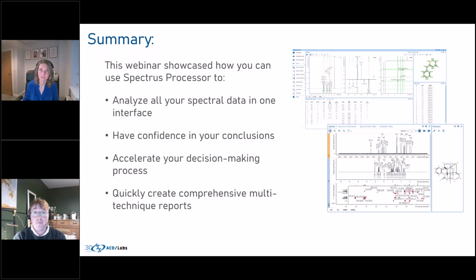Okay, brilliant. We've got someone here saying they're more interested in academic analysis of polymers, more specifically NMR and FTIR data. Do we have any more detailed analysis, or can we do any more for polymers? So how do we handle polymers? It's quite a broad question. We do handle polymers data with a variety of customers. If that's the case, get in contact with us and we can scope your use case in more detail and see whether we can help. Okay, brilliant. So same as for a couple of the others. If you want to know more about that specific use case, do fill in the form at the end and we'll be in touch directly.